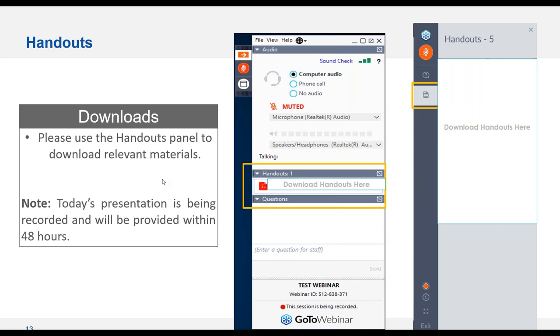This was an oil analysis question. Will the same particle size issues be present in the solvent-based samples? Yes, it can be. Anything that affects the viscosity and surface tension of the liquid can change the particle size that's being generated by the nebulizer, right? So it all comes down to that.